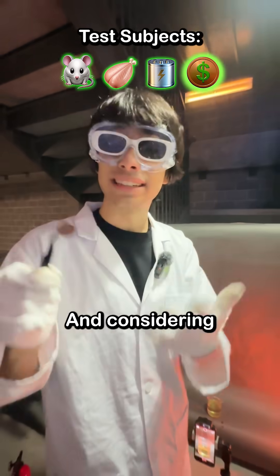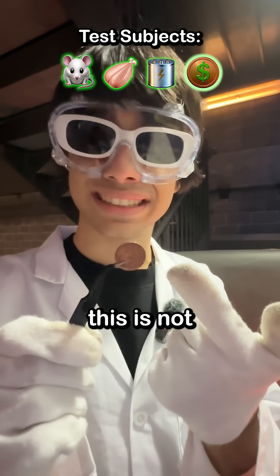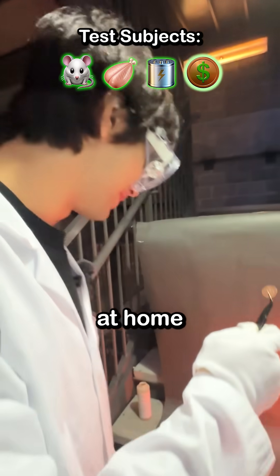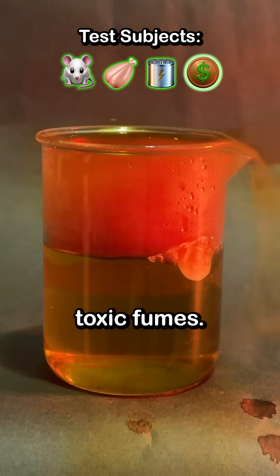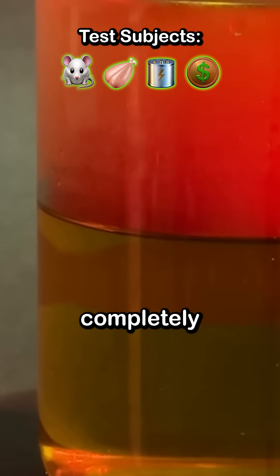Finally, we have the penny. And considering everything that's happened so far, I feel like this is not going to survive. Please don't try this at home. Three, two, one. Instantly, it started bubbling, releasing toxic fumes. And just like that, completely dissolved.